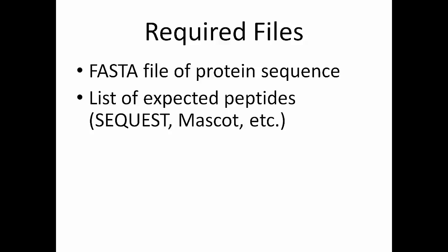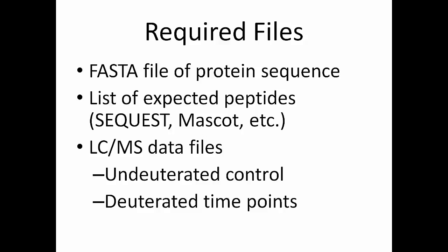To use HDExaminer, you'll need three things. First, you'll need a FASTA file of your protein sequence. Next, you'll need a list of expected peptides derived through something like a Sequest or Mascot search. And finally, you'll need your LCMS data files, both your undeuterated control experiment and any number of deuterated time point experiments.